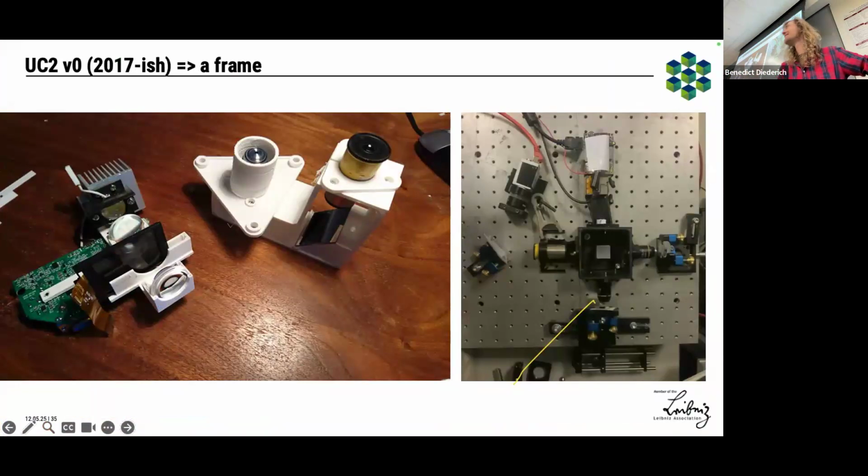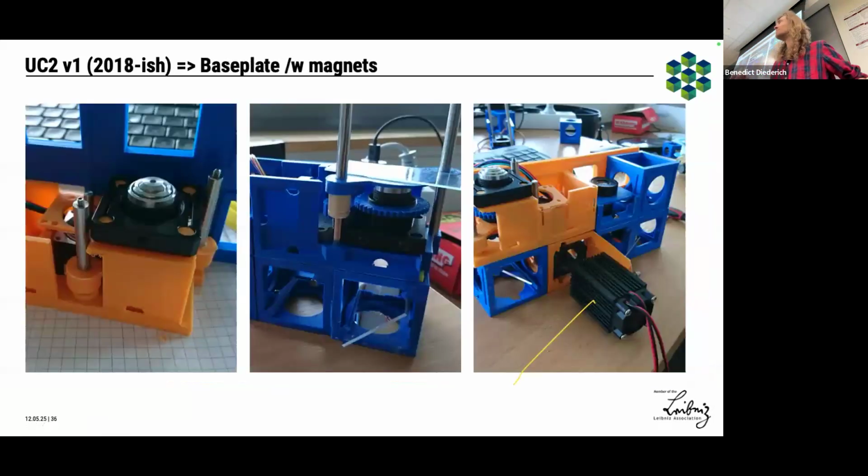It's kind of a family trip with the cubes here. So this is somehow how it started. This was already a little bit modular. You could have a lens, an ocular, an adaptive illumination. It was very fragile. I think that was the very first one I made with 3D printing. Then it got a bit better, but the modularity was lost. And then I was like, okay, we have to be modular somehow.